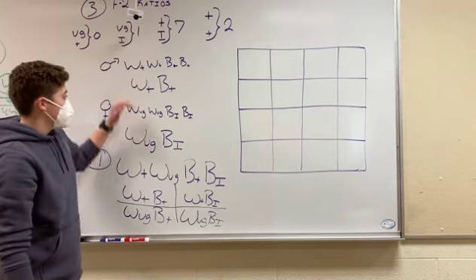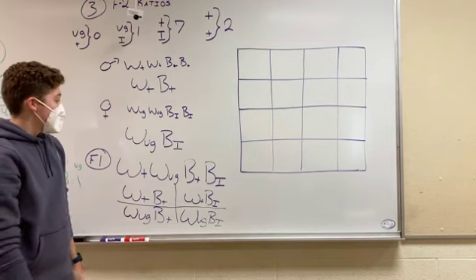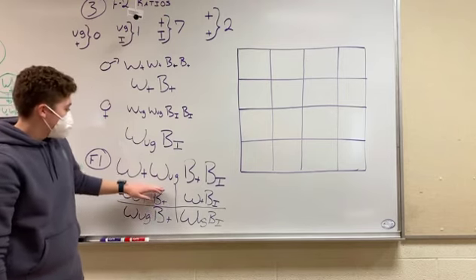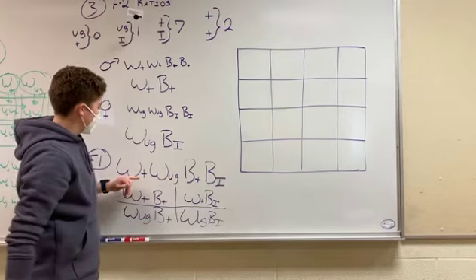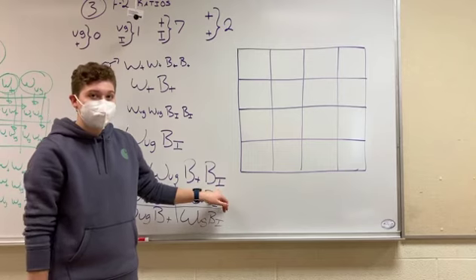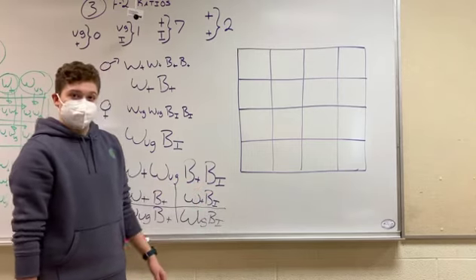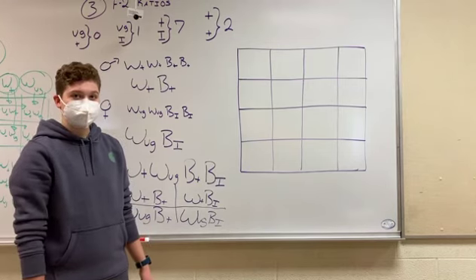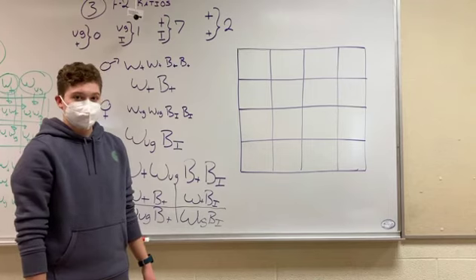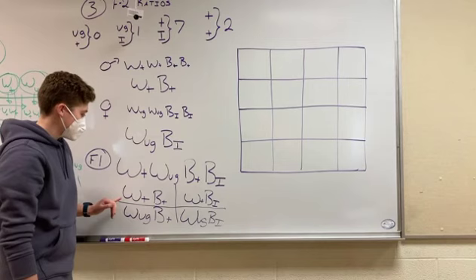So wings, we already knew that. Wild type, that's what you get. But if they're yellow bodied, even with, so this is what we're looking at here, wild type wings, if they're yellow bodied, that means yellow has to be dominant, not the wild type. Perfect. So that was that little foreshadowing that I did before I stepped behind the camera. Becca guided us through that very well with wild type wings being dominant, but the non-intuitive yellow body being dominant.